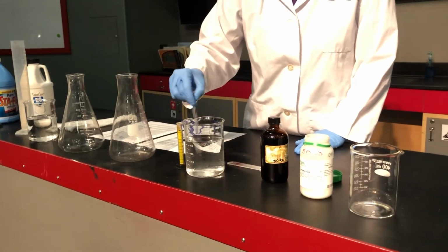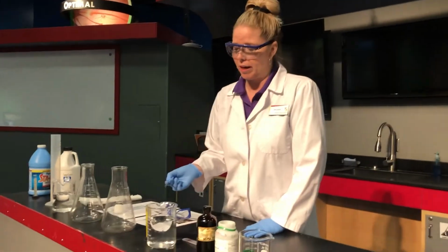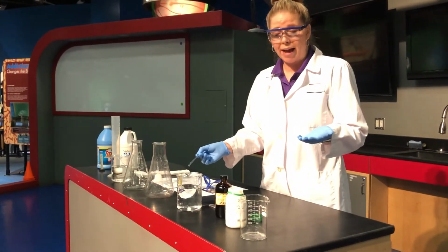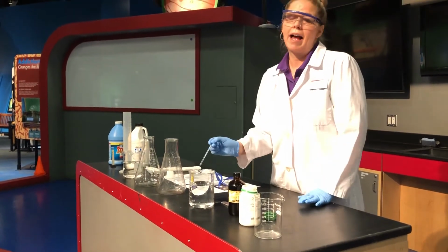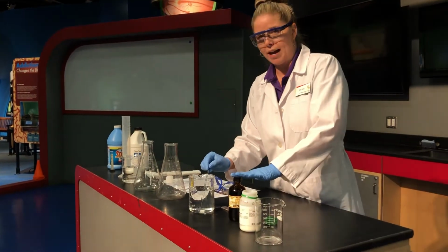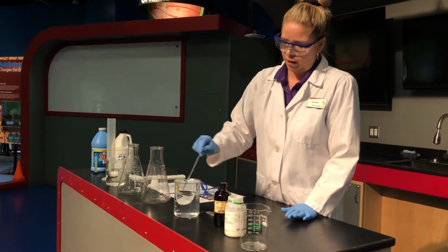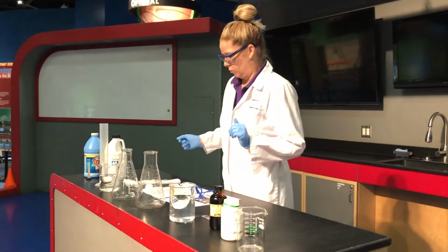So we have already done some science today. We've turned this brown solution back to clear. And you can actually see why in the olden days, we'd have magic tricks going on maybe on the streets of chemicals being put together, and it looks like magic. We use some kind of special formula or magic spell to turn it clear, but actually it is just a chemical reaction. Our vitamin C is interacting with our iodine to turn it into a clear form. So we have just a little bit at the bottom that I'm gonna stir up, and we're gonna leave that there for just a minute because that's not the only reaction we're looking for today.